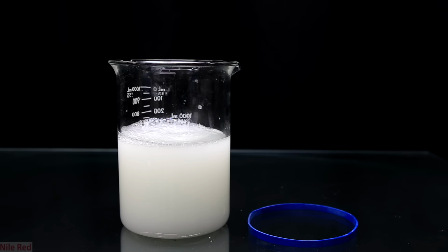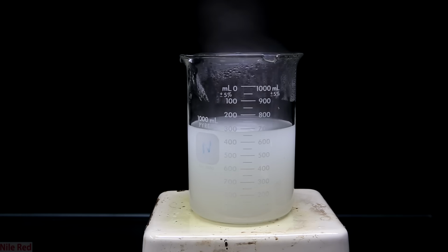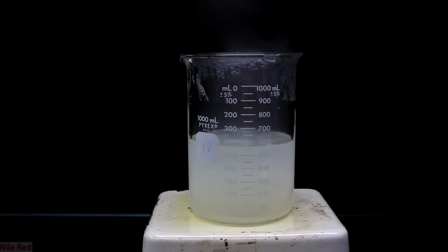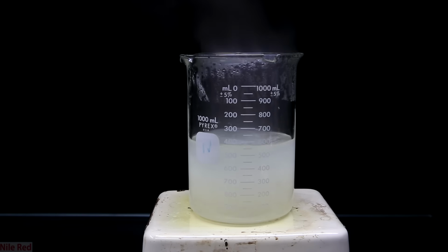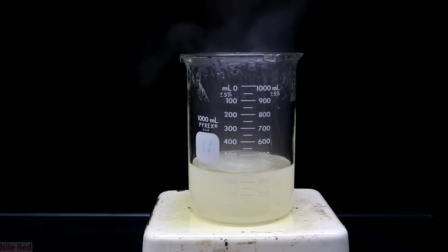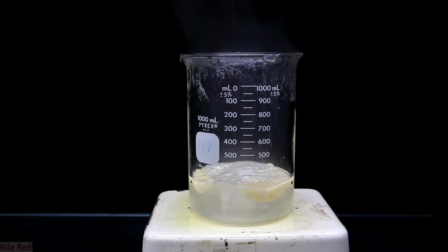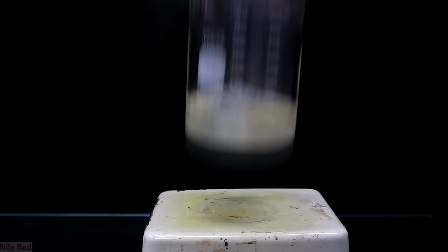Now what we're going to do is boil down the solution to reduce the volume. This will do 2 things for us. It will concentrate our sodium iodide solution, but also the reduced volume will cause the rest of the polymer to precipitate. As we boil it down, the solution actually starts to clear up a little bit, and we're left with a large chunk of polymer floating on the top. The volume was reduced to about 250 milliliters, and then it was removed from heat.